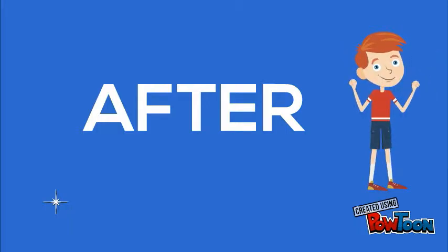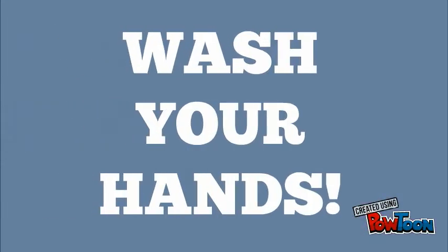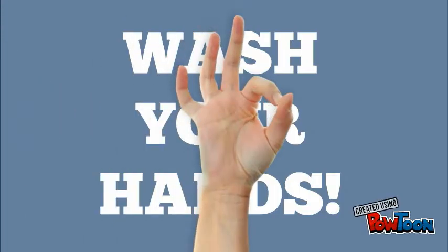Finally, I'm going to talk about rules you should follow after you're done your procedure or experiment. Put everything back where you got it from and remember to put the safety locks on. Make sure to wash your hands after every experiment or procedure so that any substance that's not supposed to be on your hands is not on your hands.